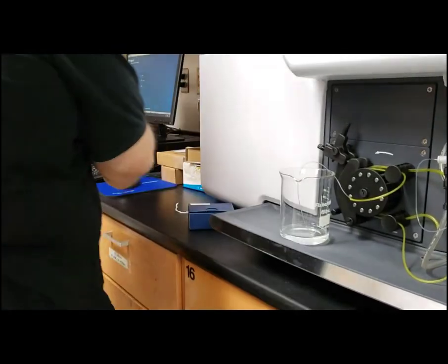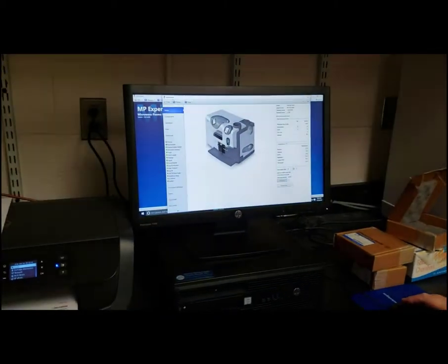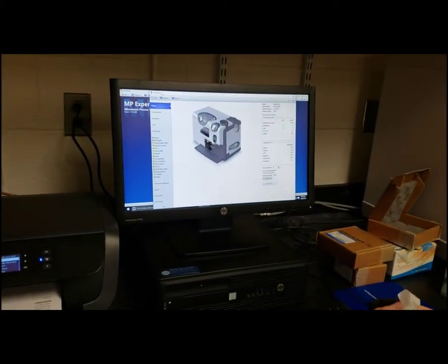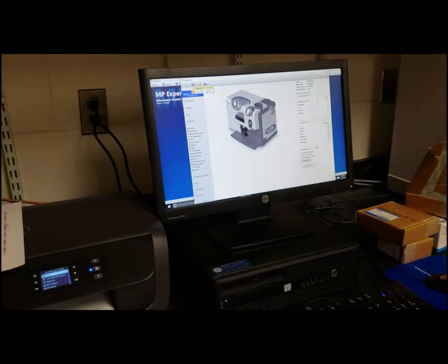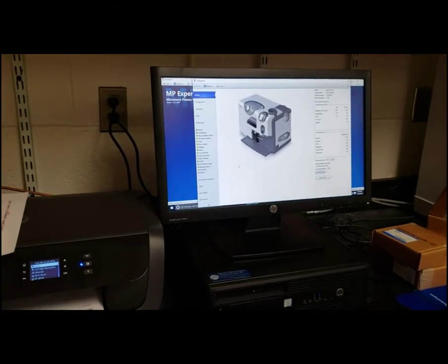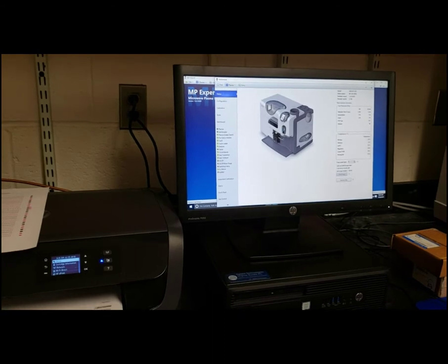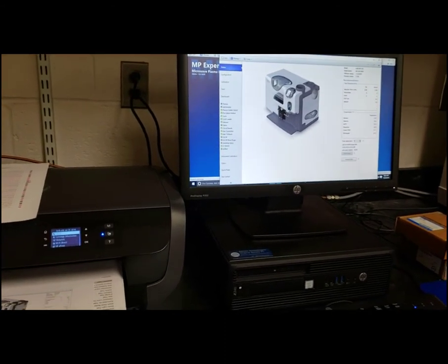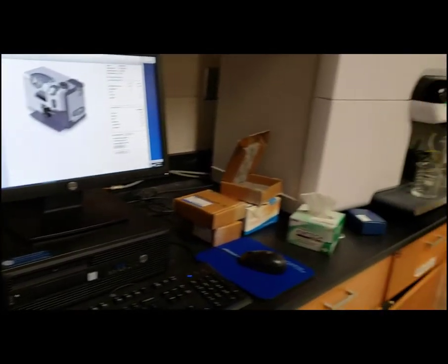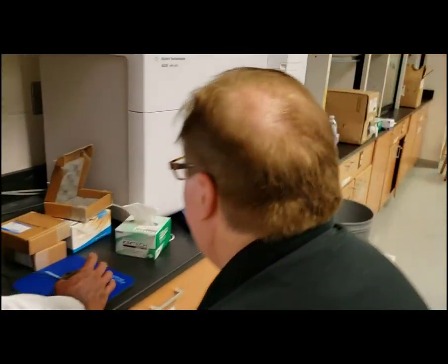So, all right. Then what we do is we can stay on that instrument page, and then we simply come to plasma on. Plasma on. Yeah, it goes through. And when you see the purple light on the glass, you know it's lit. See? Now it's lit.